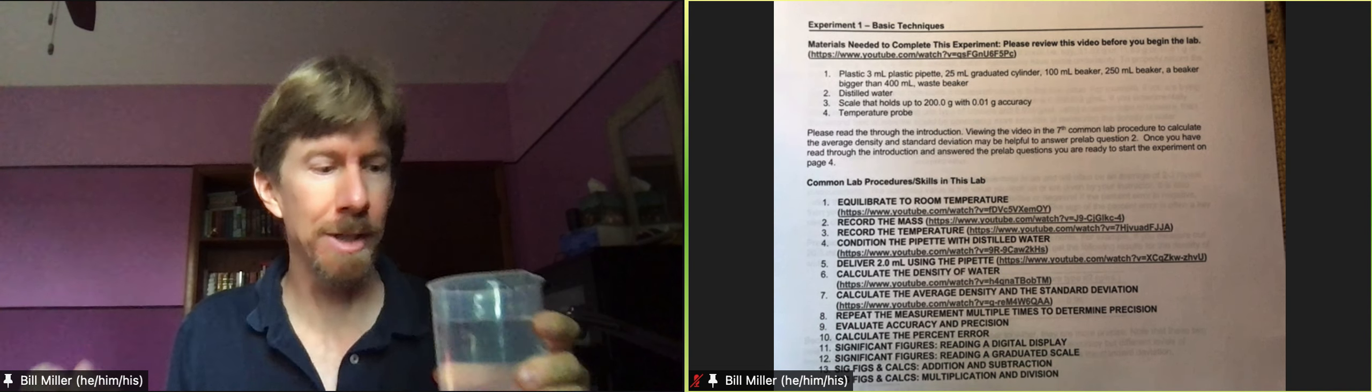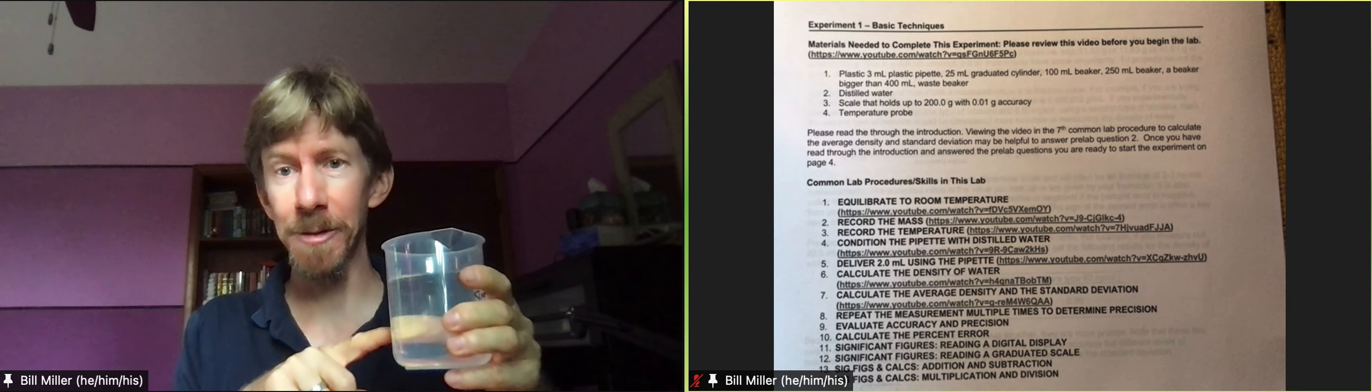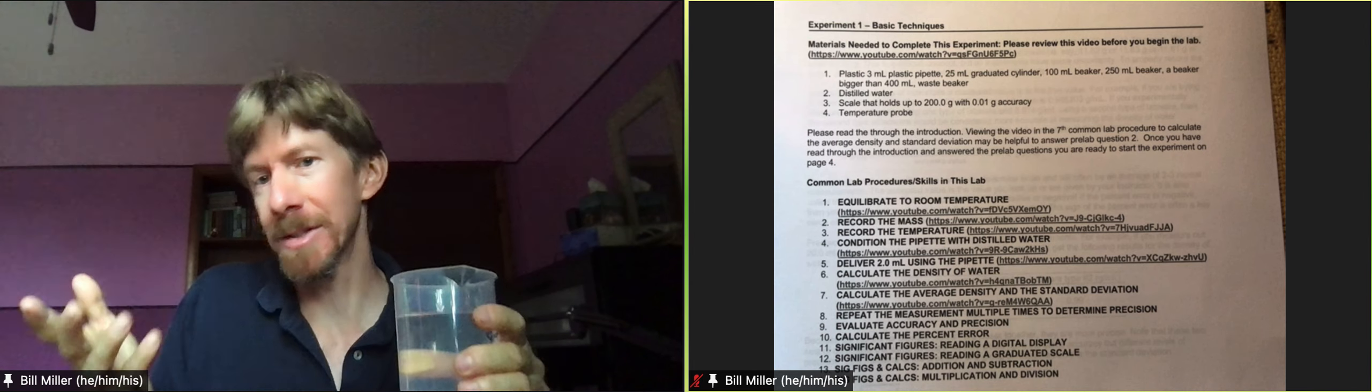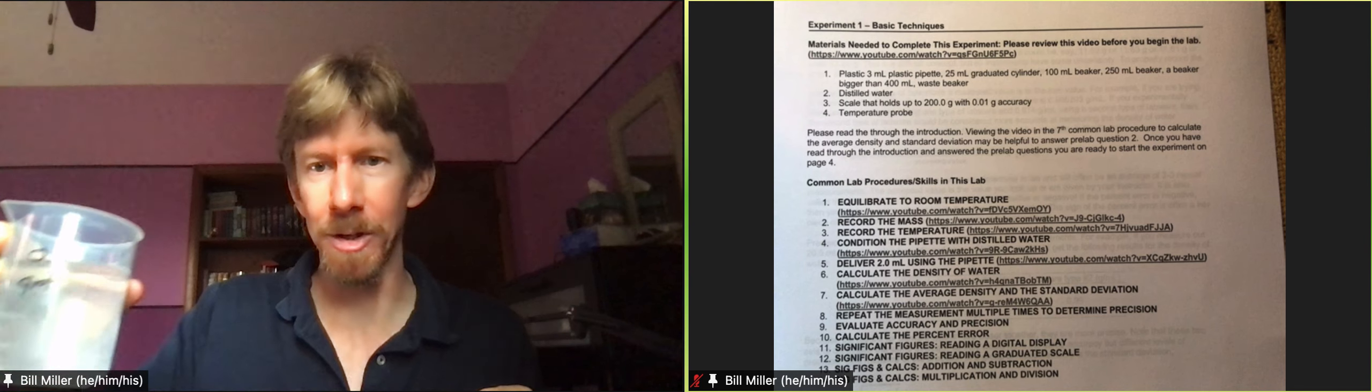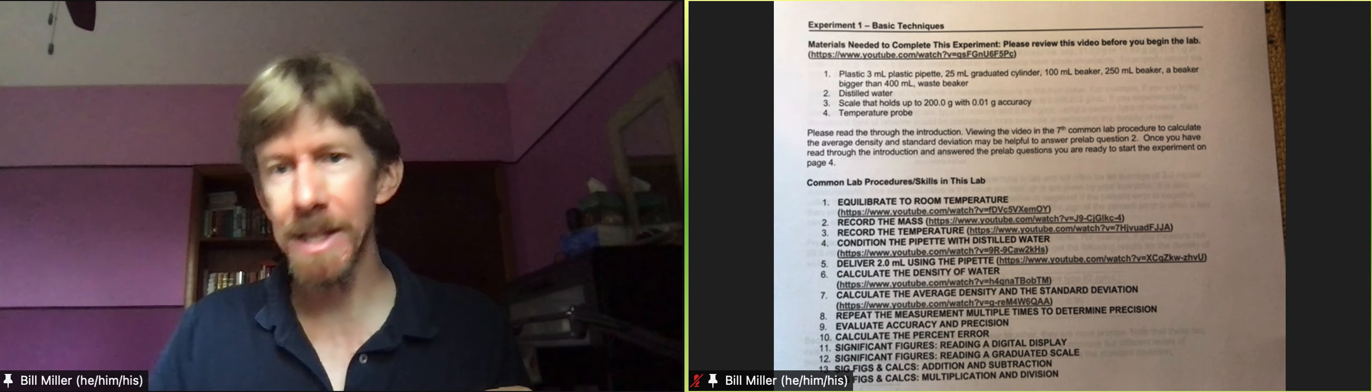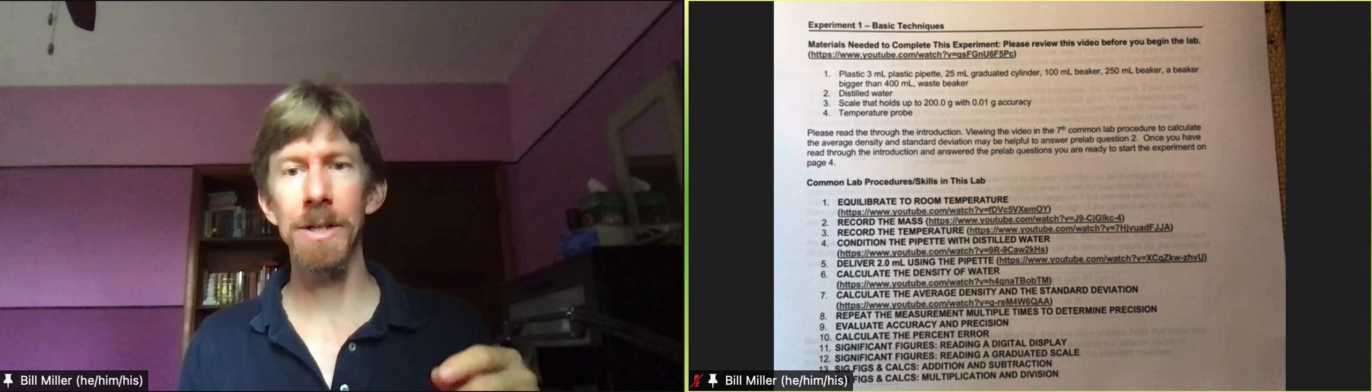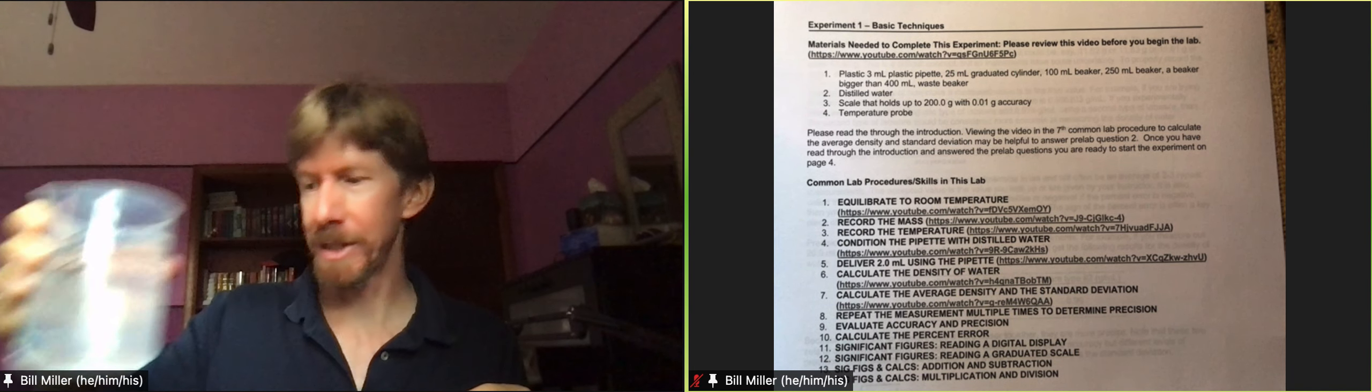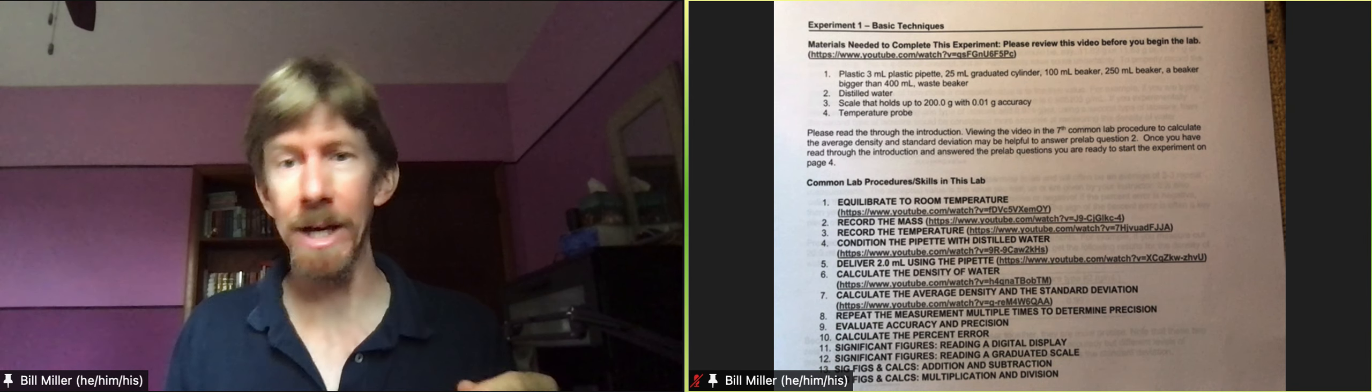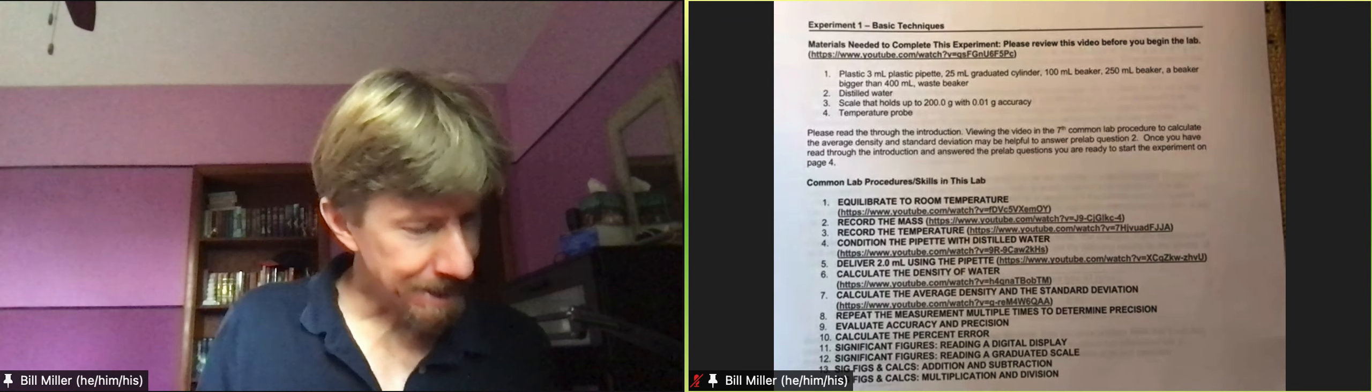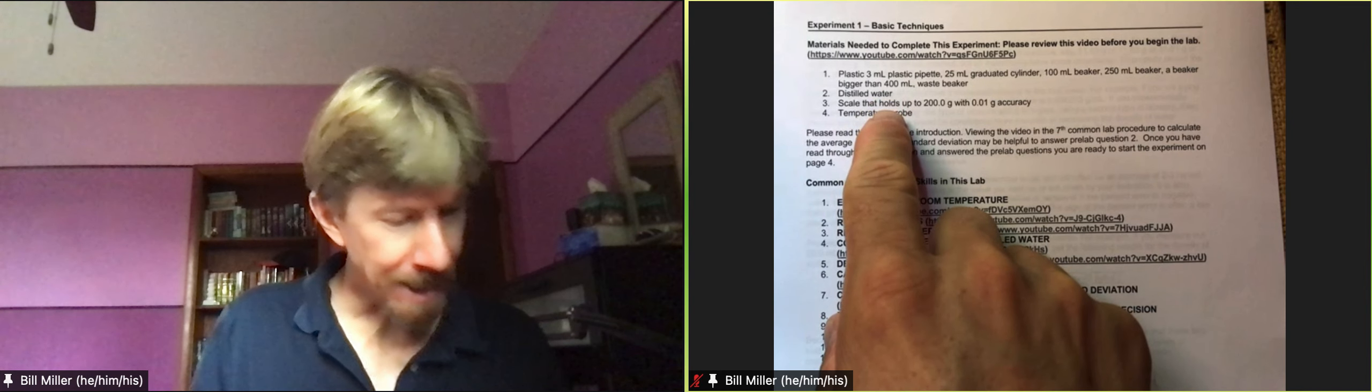So you get this, you let this sit for 15 minutes before you start the experiment. That's the first instruction and we might as well do that right at the beginning. So even before you start listening to this, get your water. Tap water is fine, it calls for distilled water but I actually have tap water here because I don't have any distilled water today.